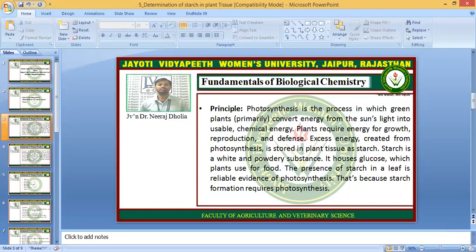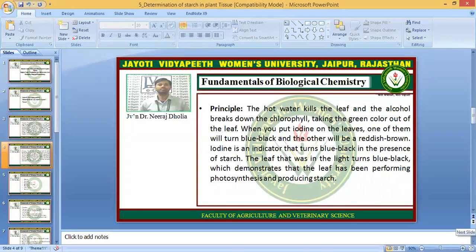Starch formation requires photosynthesis. In the practical, we use hot water that kills the leaf, and alcohol which breaks down the chlorophyll, taking the green color out of the leaf. When you put iodine on the leaves, one of them will turn blue-black and the other will be a reddish brown. Iodine is an indicator that turns blue-black in the presence of starch. The leaf that was in the light turns blue-black, which demonstrates that the leaf has been performing photosynthesis and was producing starch.